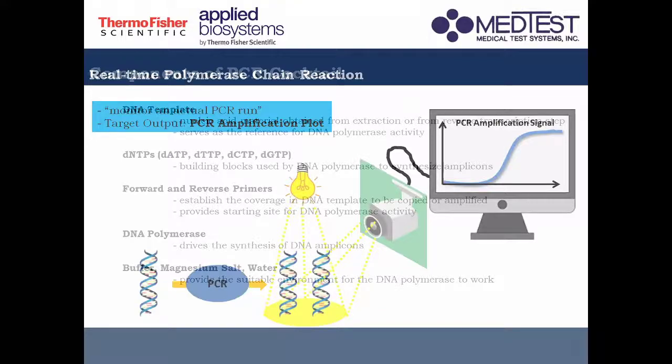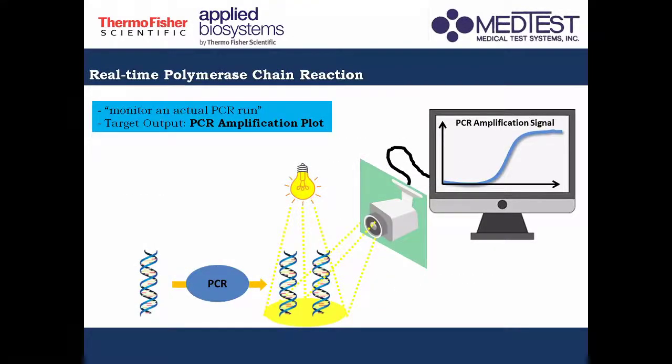So, what about the real-time polymerase chain reaction? So, kanina, na-discuss ko na yung polymerase chain reaction technique. But what about the real-time polymerase chain reaction? So, for the real-time polymerase chain reaction, this is basically just doing a PCR technique and at the same time monitoring that process.